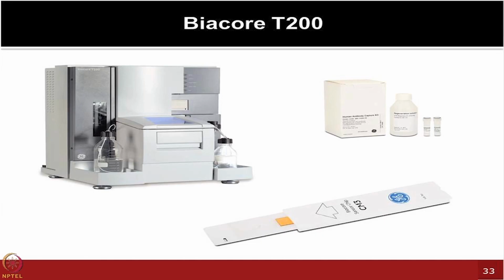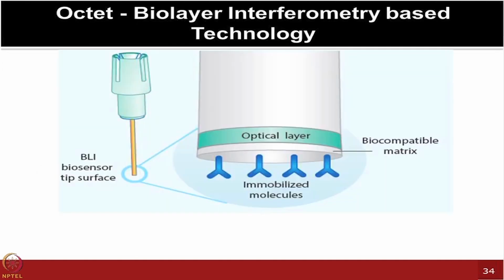So many times, if you are in the discovery development mode and you have hundreds of compounds or libraries to screen, this may not be the best platform to start with, because you are limited by how much cost you have to screen that large number of compounds. So new technology platforms like the one I am showing you here, which is a biolayer interferometry based platform, can be very powerful for the first round of screening.